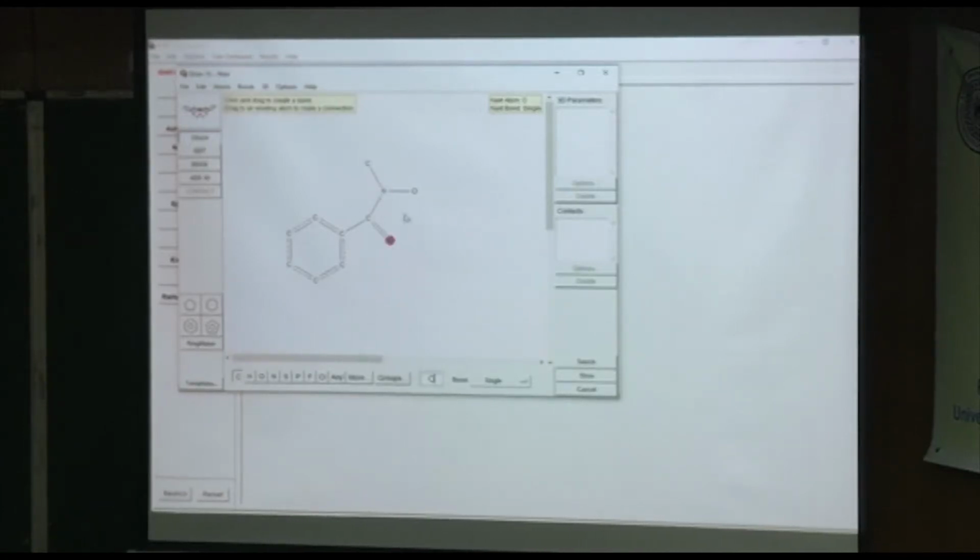If I want that to be a methyl group, you can go to groups, pick CH only, click on methyl, and just change that to methyl. So that's roughly what the ligand looked like, except that it had NO2 in this para position here. And then there's a tin that's bonded to this oxygen and this oxygen. Okay, so I just defined the structure at this point.